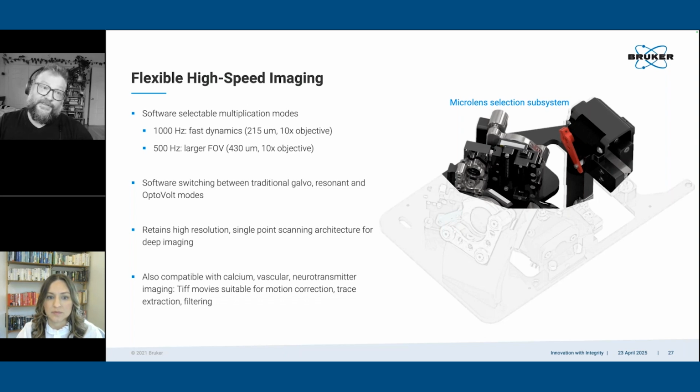And this is an interesting one, because the ETL Z range is not totally uniform from its Z equals 0 point. I don't remember how much it goes above versus below, but it should extend your imaging a few hundred microns.